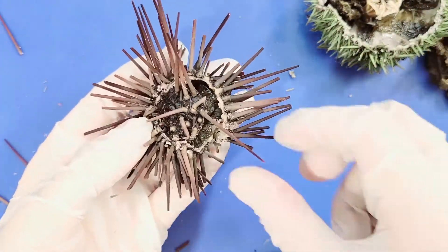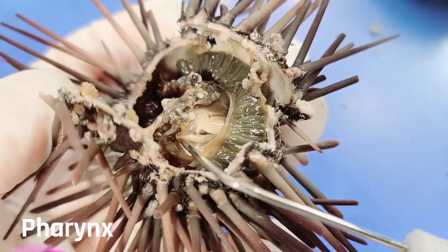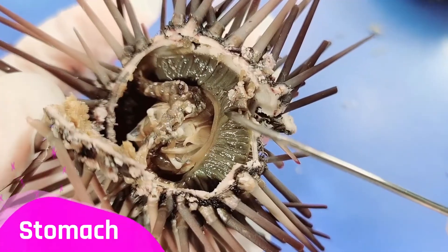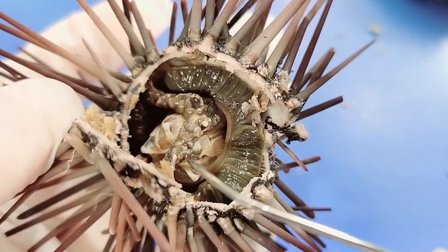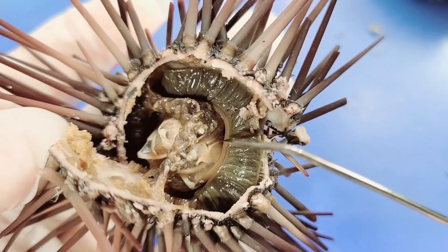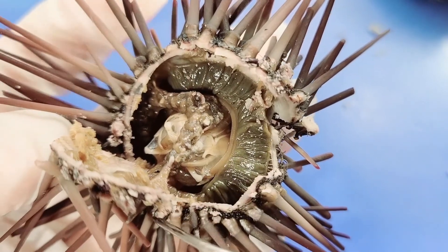Lifting the cap a bit more, we can see the digestive system really well. The pharynx leads out from Aristotle's lantern and goes down. You can see the stomach wrapping entirely around the sea urchin, and the intestine going around the other way, leading into the anus. There is also an additional yellow tube running along the stomach called a siphon, which is involved in the reabsorption of water or nutrients from food.